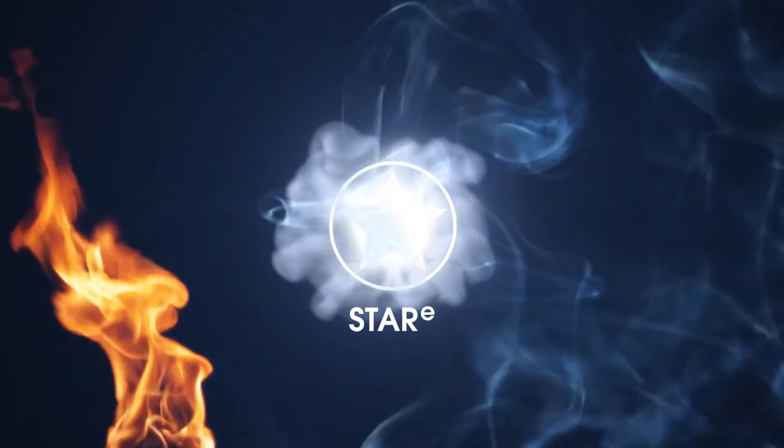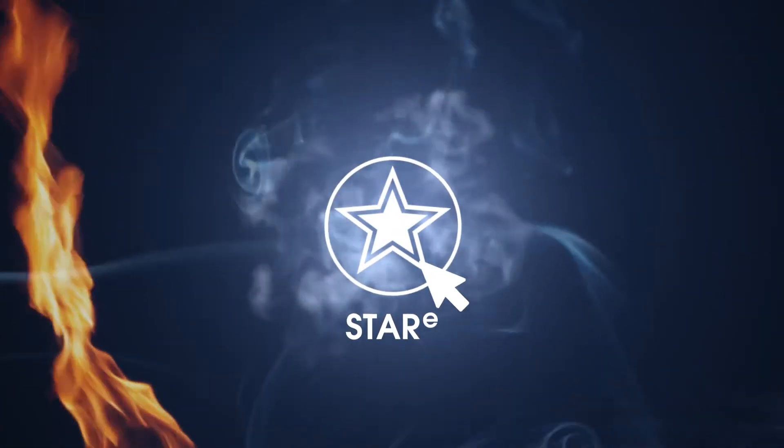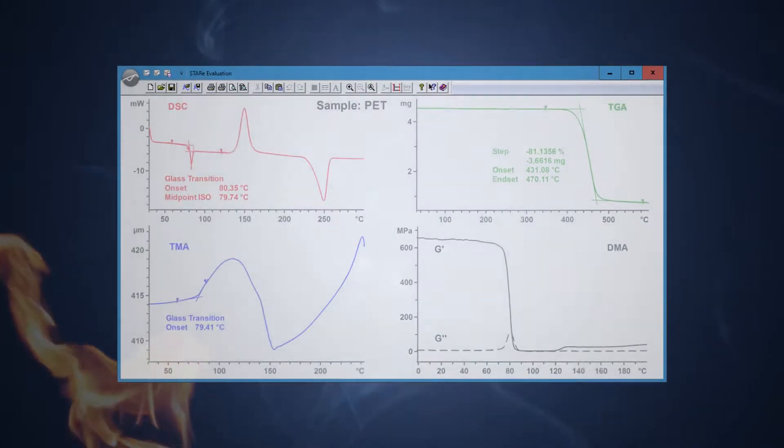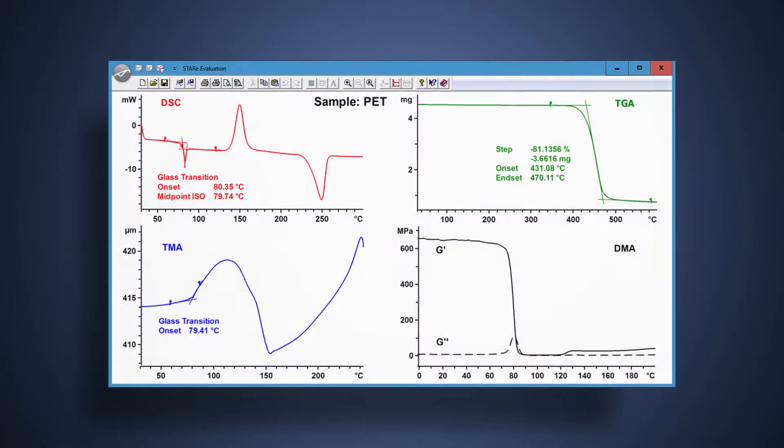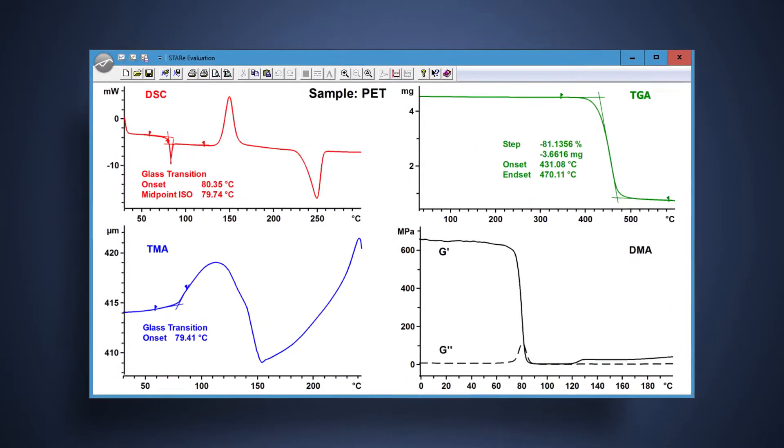STARe software, the standard in thermal analysis, provides unrivaled flexibility and unlimited evaluation possibilities.